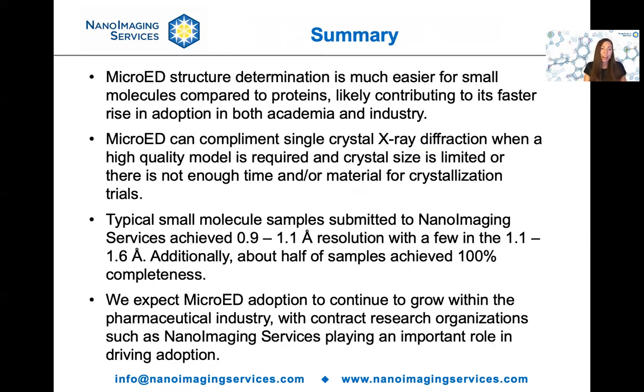All right, with that, I'll summarize and just say that microED structure determination is much easier for small molecules compared to proteins, which is likely contributing to its faster rise in adoption, both in academia and in industry. I'll also just state that microED is a wonderful complement to single crystal X-ray diffraction when a high quality model is required and crystal size is limited, or maybe there's just not enough time or material for crystallization trials to get a crystal suitable for single crystal X-ray studies.